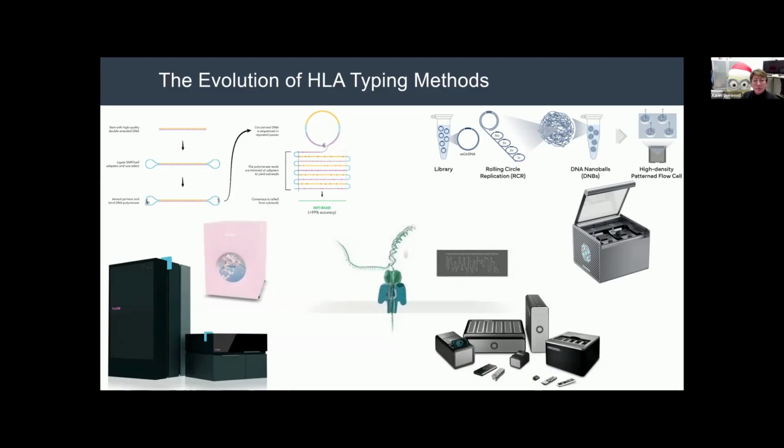Clinical reports now describe the implementation of long read HLA typing for high throughput, full gene phasing with rapid workflows with real-time analysis, and it can integrate with other genomic assays, marking the latest milestone in the evolution of sequencing for HLA. These advances complete a historical arc from phenotypic serology to comprehensive sequence-based haplotype-resolved genotyping that underpins contemporary transplantation and precision immunogenetics.